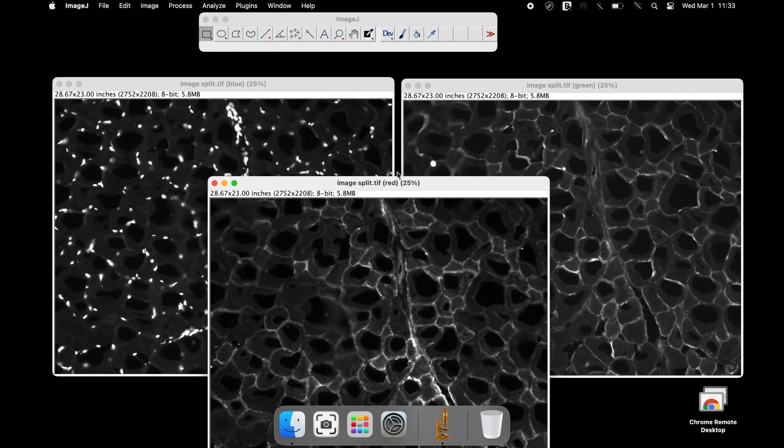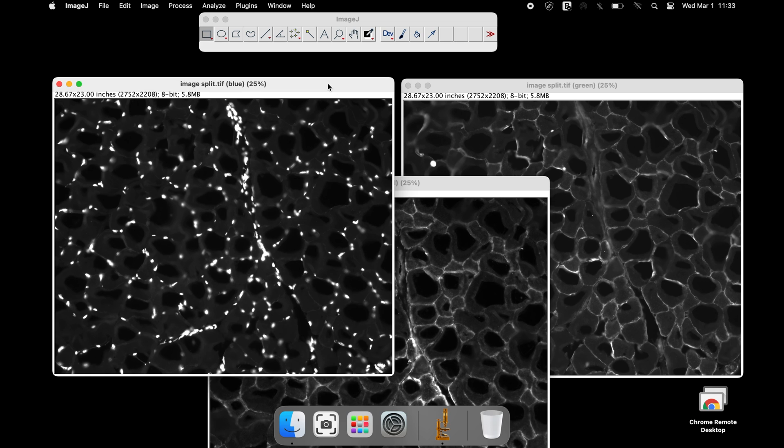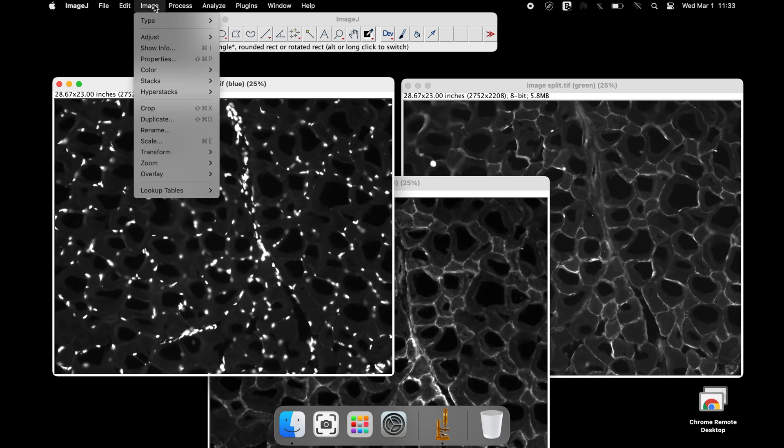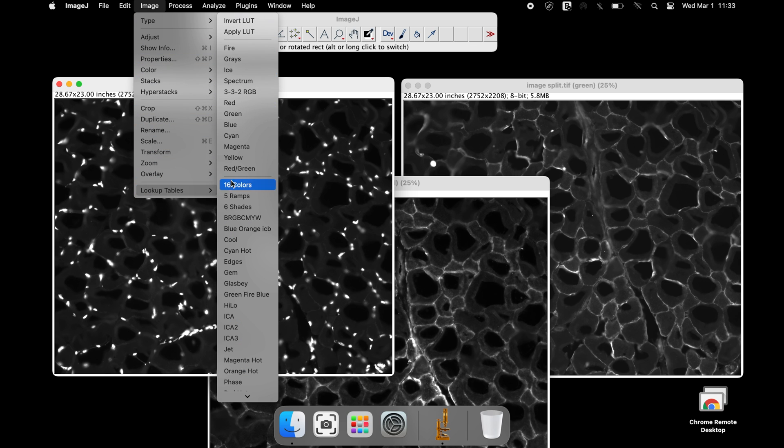The blue channel, the green channel, and the red channel colors. If the image output is grayscale, the image color can be applied again. Click on Image, Look Up Tables.